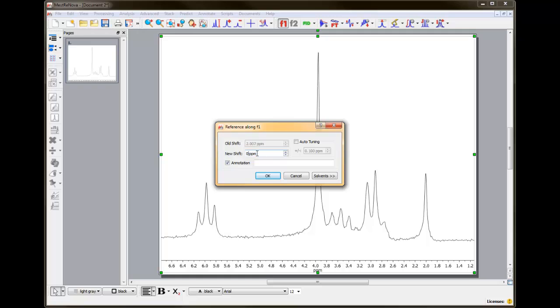Since the peak I selected is TMS, and its chemical shift is defined as 0 parts per million, I'll type 0 and hit OK.